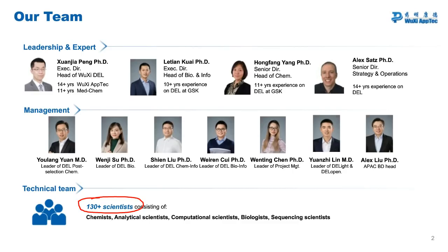Do you run multiple rounds of screening to enrich the hits? Most screens with large libraries have required several rounds to remove nonspecific binders. Or do you counter screen, or do your counter screens eliminate this requirement? So we require, and we ask that you run, 3 rounds. However, you will save some of the sample after the second round. And when you send that back to us, we will do qPCR on both the products of the second round and the third round, and depending upon those results, we will sequence the results from after the second round or the third round. So you will certainly run three rounds, and then we will make the choice as to which one is the best for the sequencing.